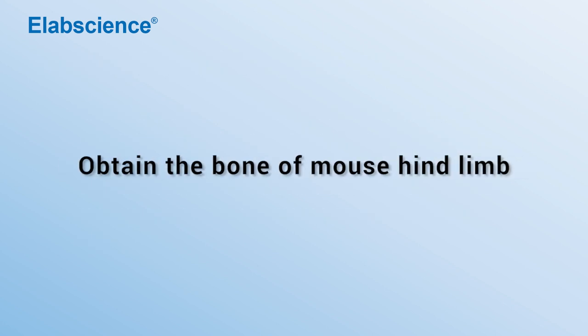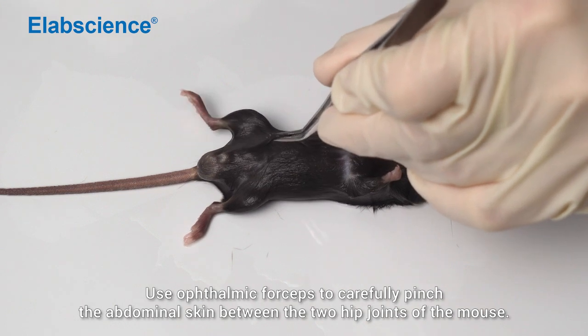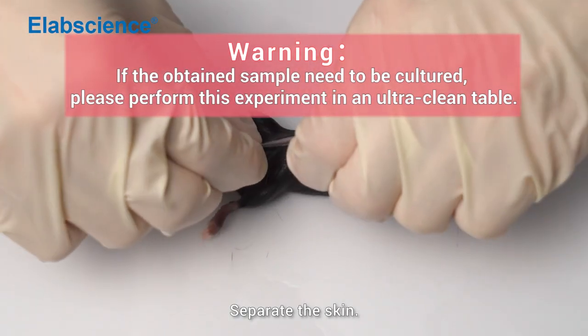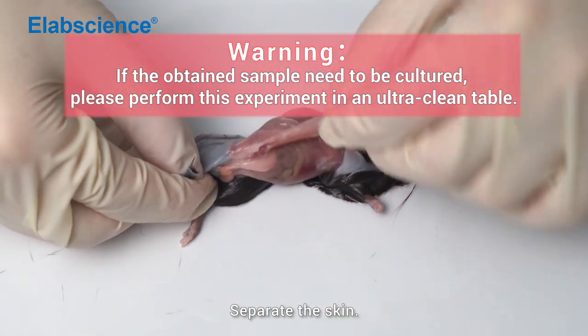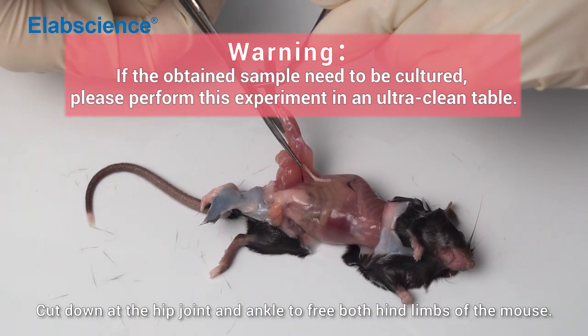Obtain the bones of mouse hind limbs. Use ophthalmic forceps to carefully pinch the abdominal skin between the two hip joints of the mouse. Carefully cut it with ophthalmic scissors and separate the skin. Cut down at the hip joint and ankle to free both hind limbs of the mouse.